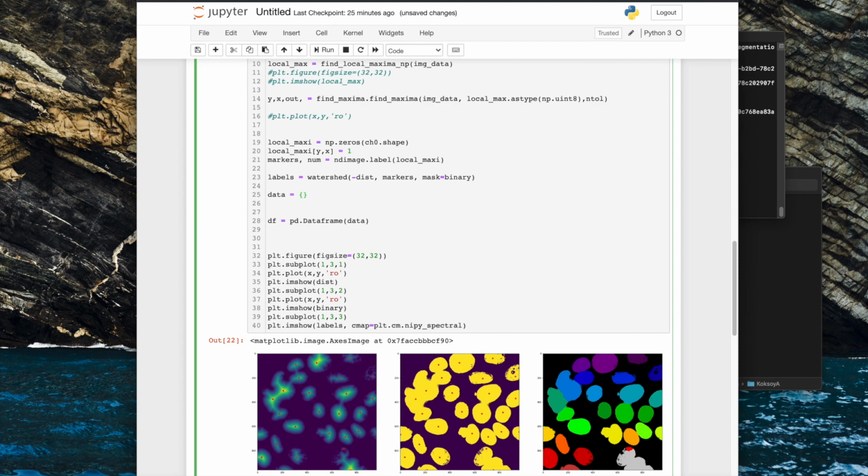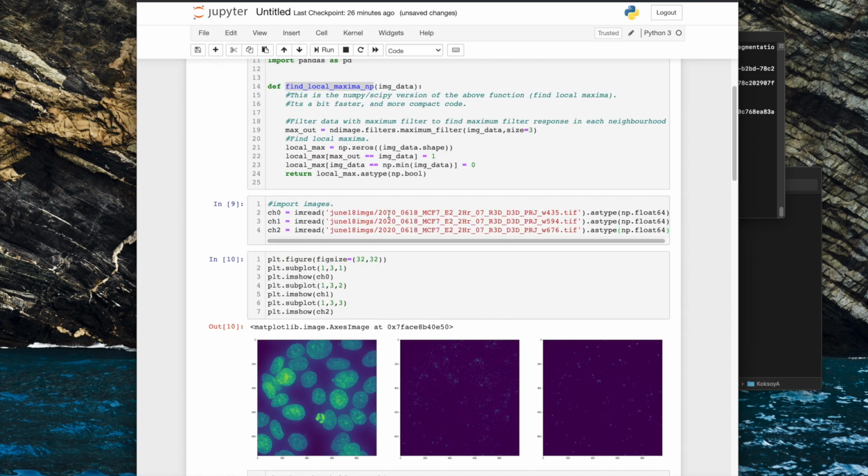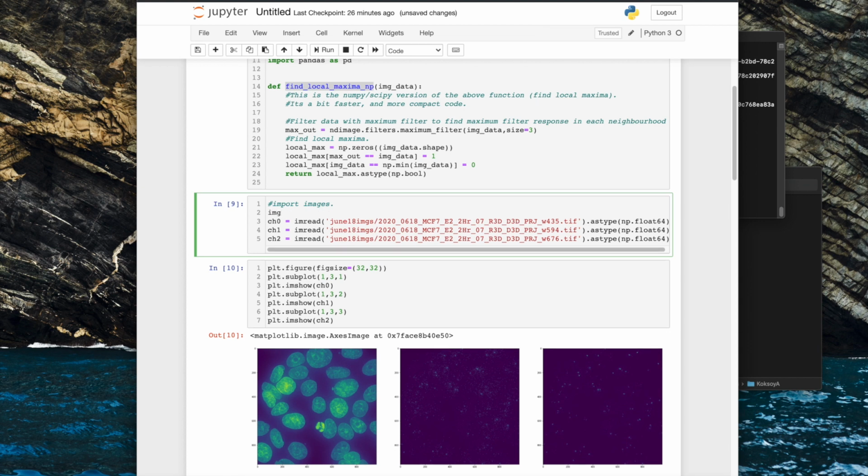So to do this, I'm basically defining the columns. So we're going to have one column called image, and this is the image name here really. So what I'll do is I'll say image name is this.